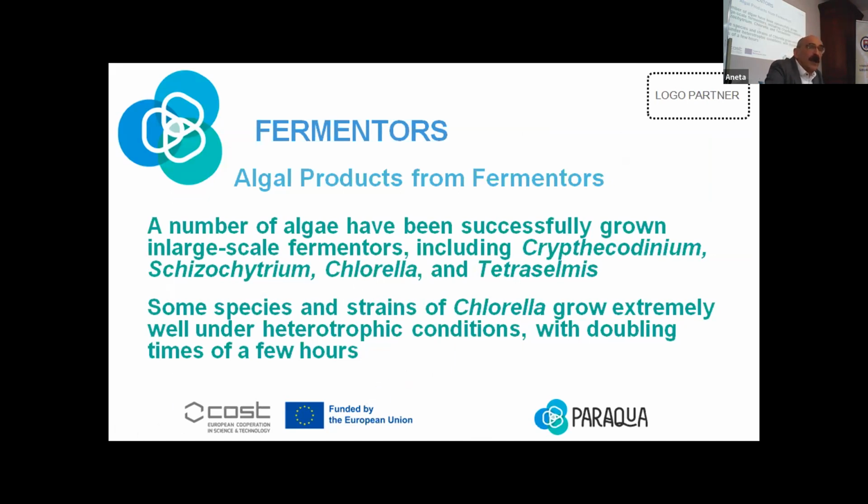So some algae, I just put different species that are grown at, let's say, larger scale in fermenters. We said that 500 liters, 1,000 liters is the biggest fermenter. I never saw something like that, and I don't know how much that costs. But these are the species that were successfully grown in fermenters.